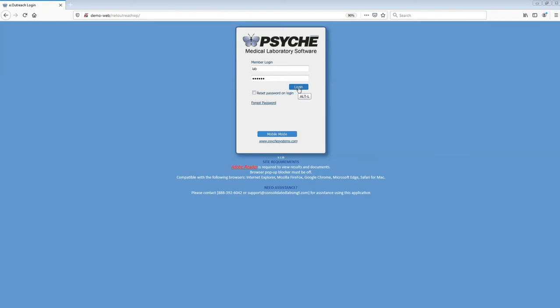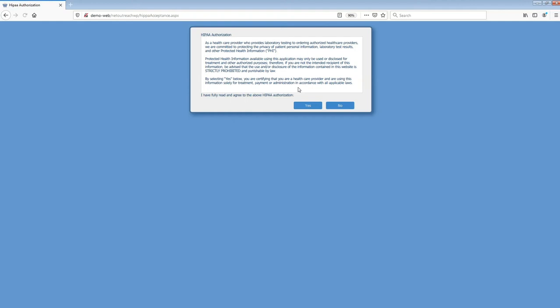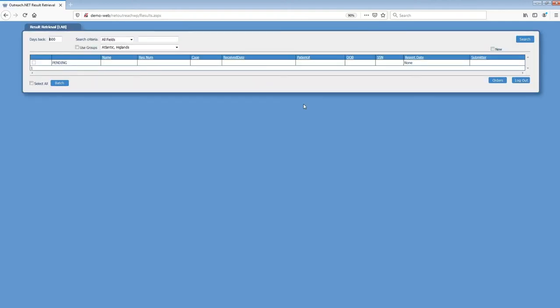Alright, let's get logged in here. I'm logging in with a lab user account, which will give me access to all results and orders, as opposed to a physician user account, which will give them access to only reports and orders that are applicable to them.